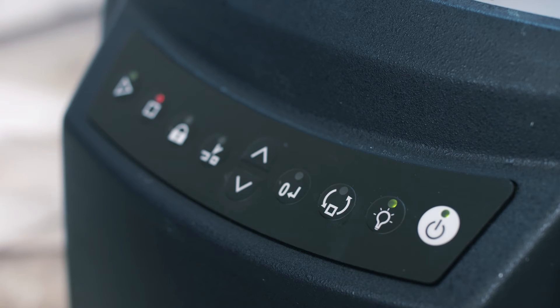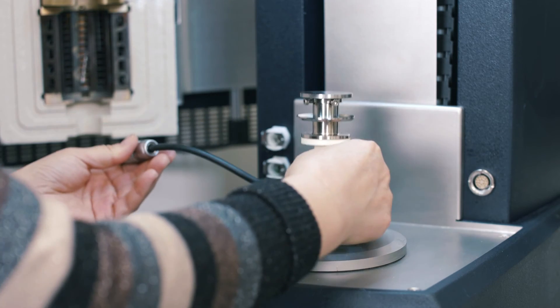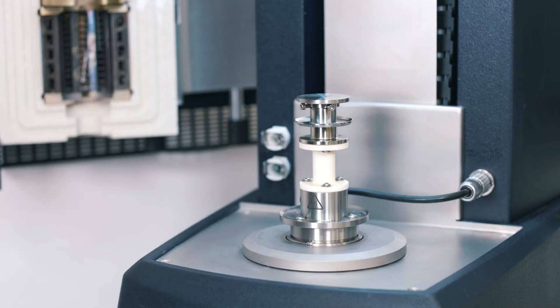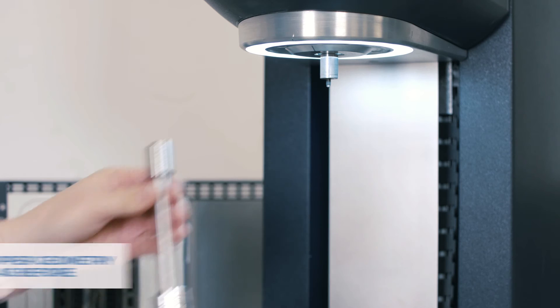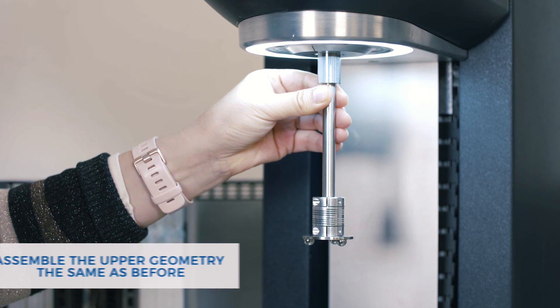From the instrument control panel, press this button to temporarily release the magnet. Put this ETC bottom geometry onto the instrument bottom stage. Then insert the smart swab plug with the red dot facing up. After that, install this upper geometry to the top of the rheometer.